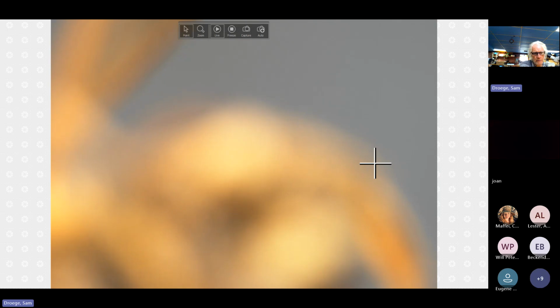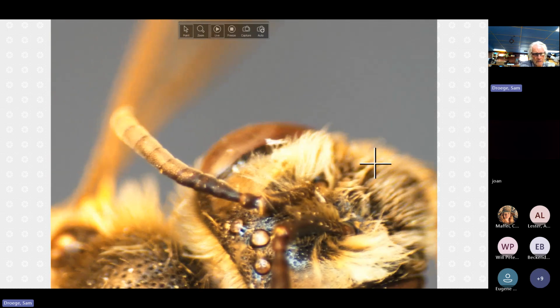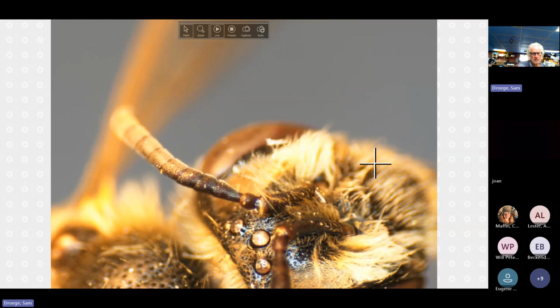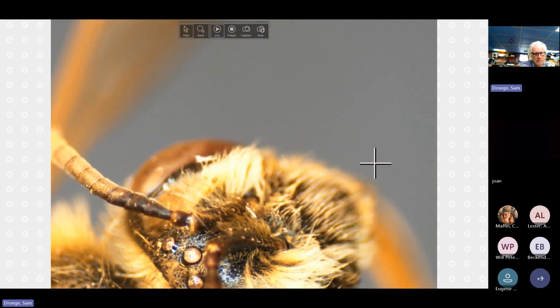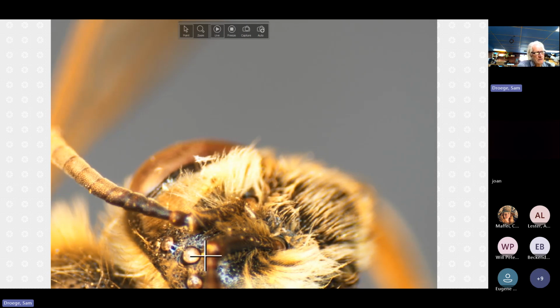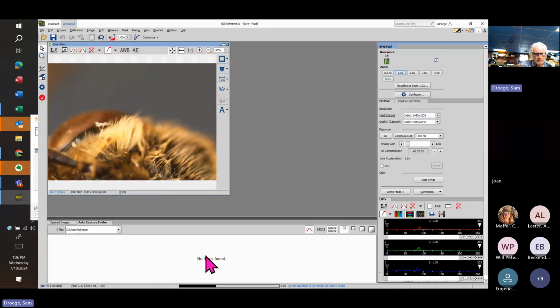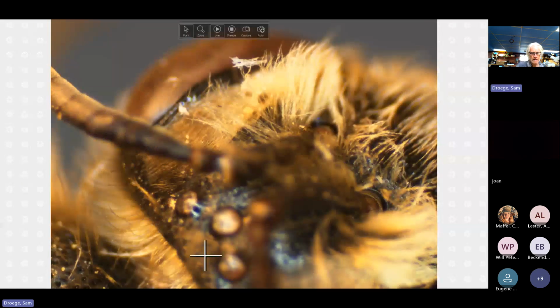Recall that the other one, we were making statements about the pits being a little bit wider than others, and that it was shiny and glossy and smooth. And this is pretty typical of almost all the others. There's one other species that fits that shiny thing, and I'm afraid it just doesn't show well under the microscope setup that we are running. And plus there are antennal segments and things in the way. Let's see if I can get that back. There we go.